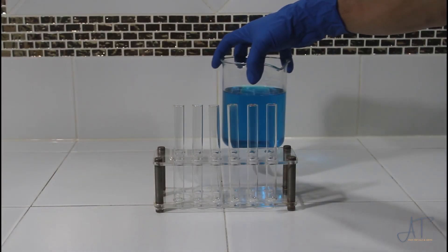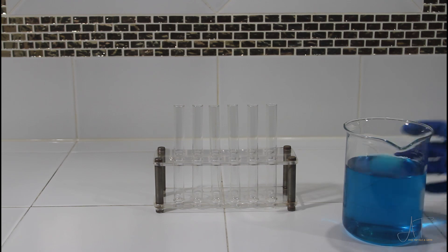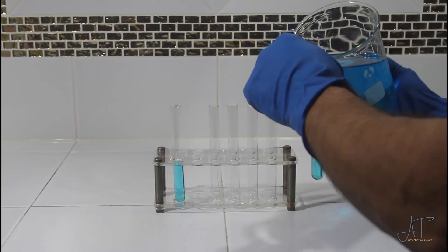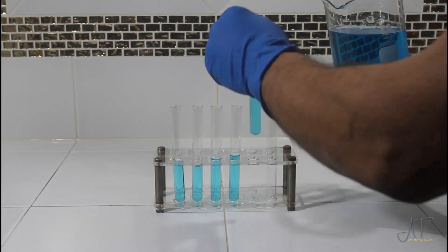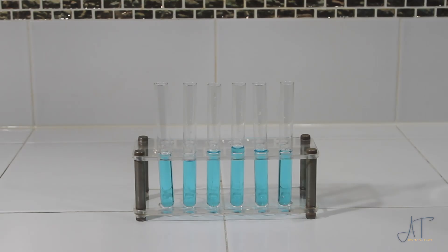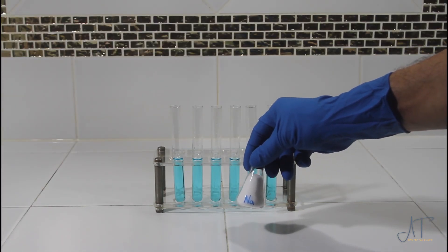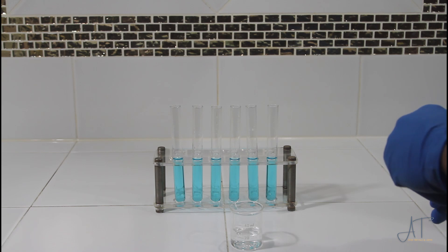I've poured off the copper sulfate, filtered it, and now we're going to add it into these test tubes and run our experiments to see if the other base metals have contaminated the copper sulfate solution, or if we can just go ahead and reuse the solution, or if it needs to be further purified. First we'll add salt to the solution and there should be no reaction. I'm going to dilute the salt in a little bit of distilled water and then add it into the test tube.